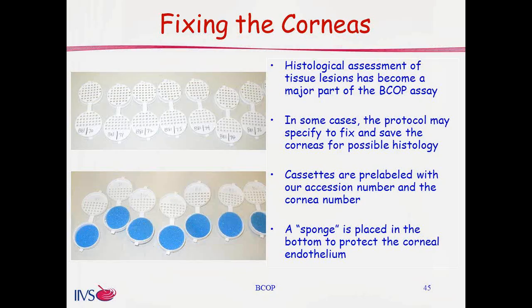Okay, now for the third endpoint, we'd like to discuss briefly collecting the corneas and fixing them for histological evaluation. Histological assessment is done to look for tissue lesions, and it's clearly become a very important part of our program with a number of clients.